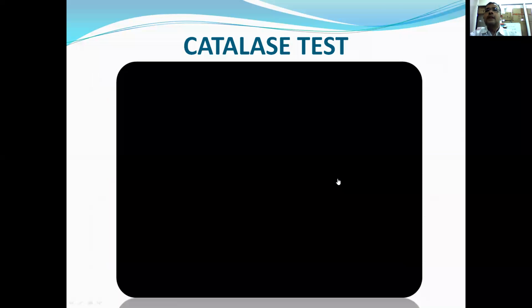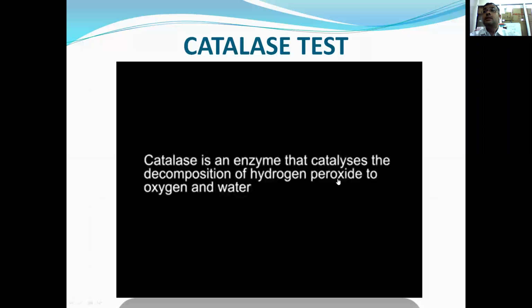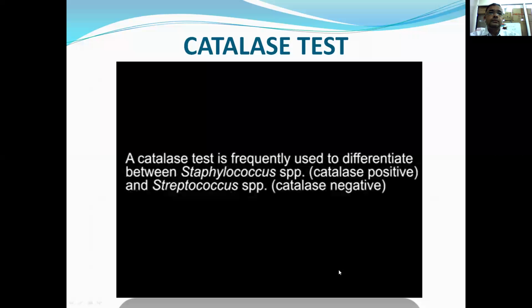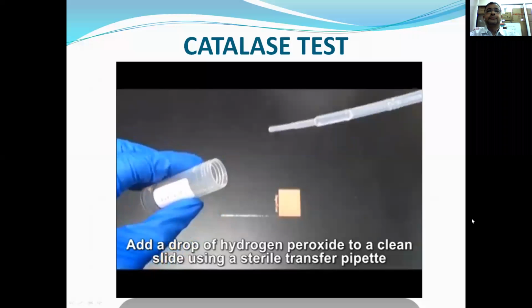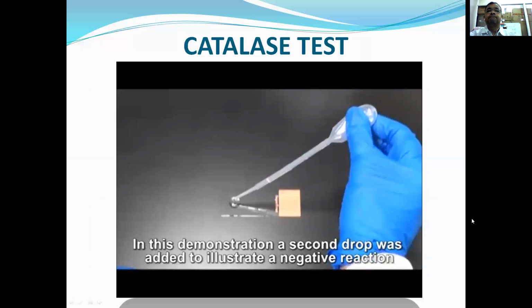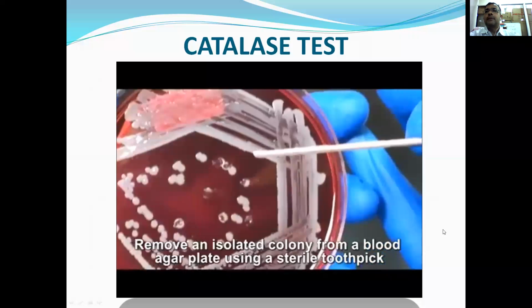Before starting, I would like to tell you that you can perform the catalase test with a ready-made disc also, but here it is a demonstration where the catalase reagent was dissolved and used. Now watch this. So 2 drops were kept.